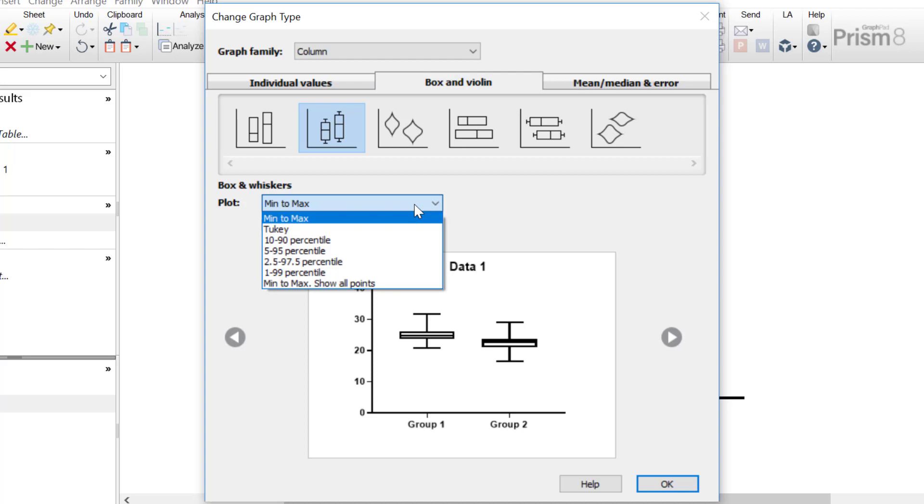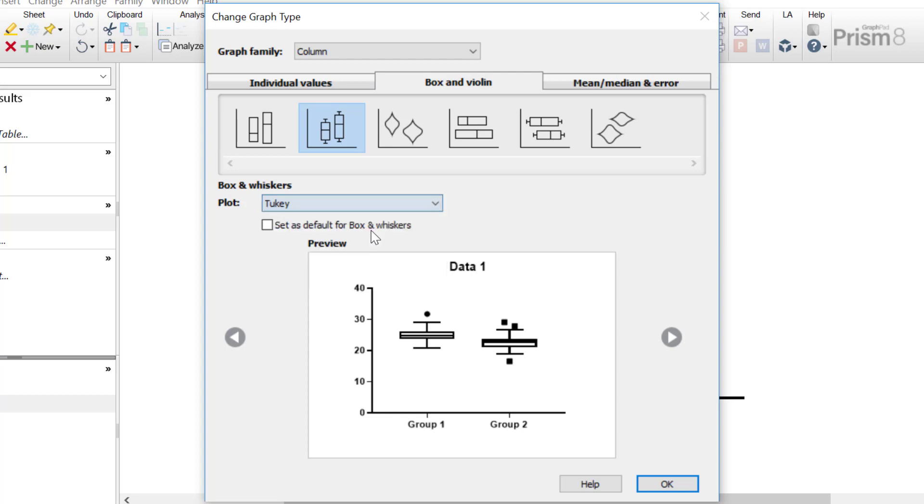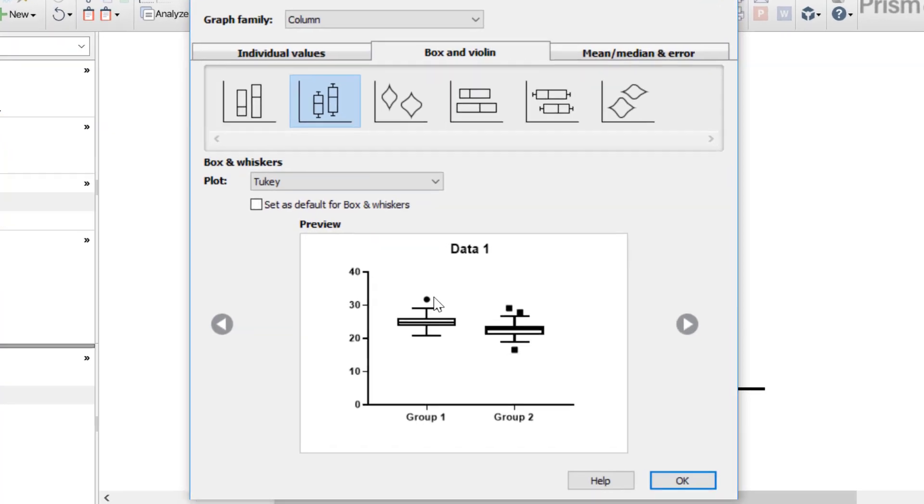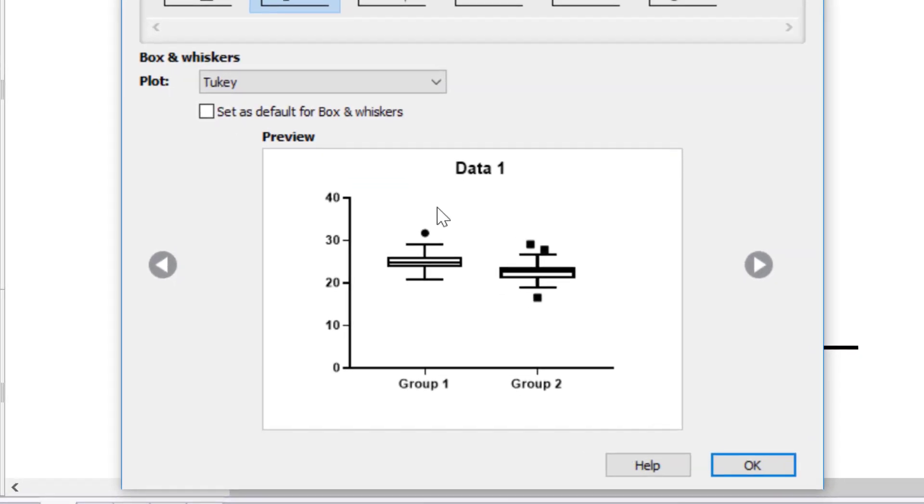However, these can be changed here. There is an option to plot Tukey whiskers. These go 1.5 times the interquartile distance or to the highest or lowest point, whichever is shorter. Notice on the plot itself, those data points which are above and below the Tukey whiskers will be identified and these are classified as outliers.